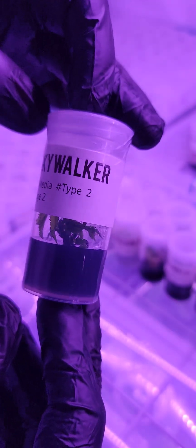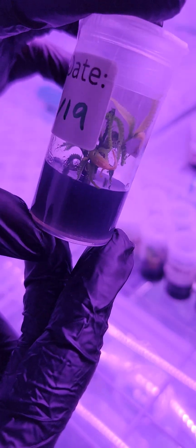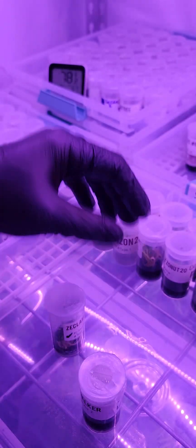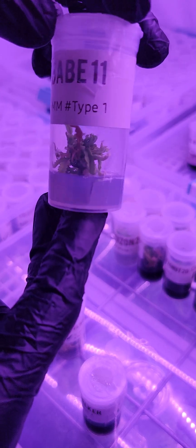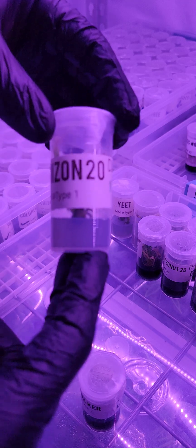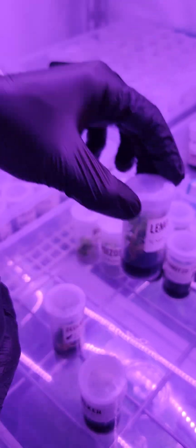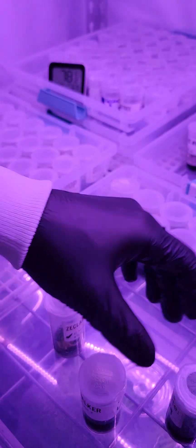You'll notice we got some old-school OGs here and they're doing really well in my Type 2 media blend. TC plants are pretty finicky — for example, babe is not a huge fan of media Type 1. So you've got to do a little experimenting to find what likes what. Poison obviously didn't like Type 1, but lemon tree doesn't love Type 2 either, though it's workable. Skywalker and the OGs really like Type 2.